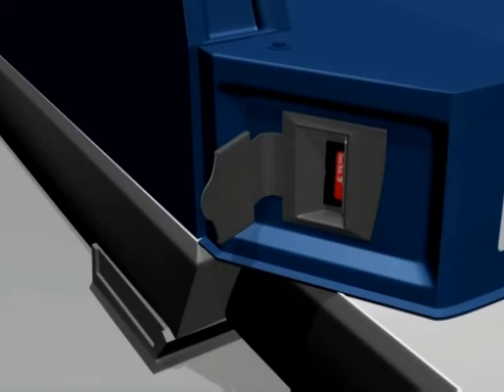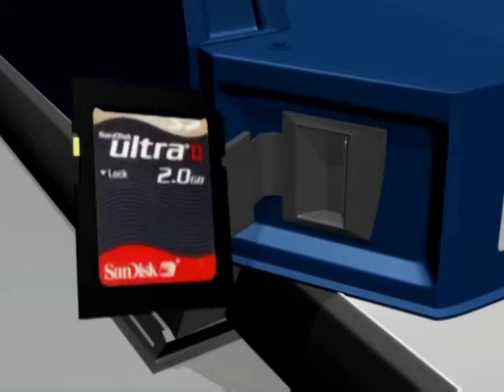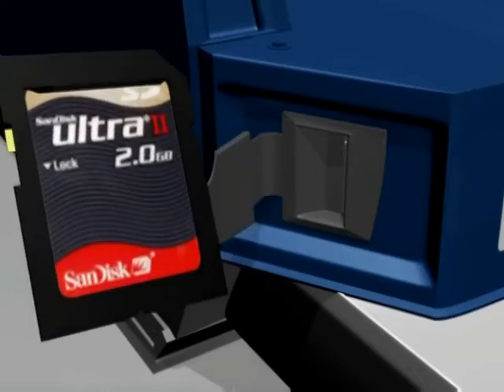If an SD card is located in the slot, the back end of the card will be visible. To remove, gently push the card about 5mm further into the slot, then release and it will spring out about 20mm. It can then be gripped and pulled out.